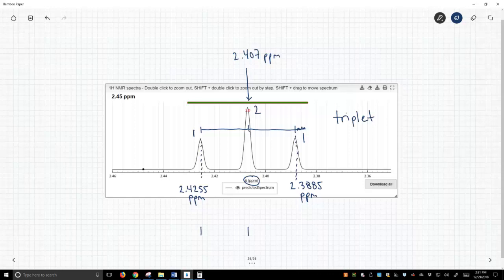The distance between these two peaks is we simply subtract 2.4255, take away 2.407, and we get a difference of 0.0185 ppm.